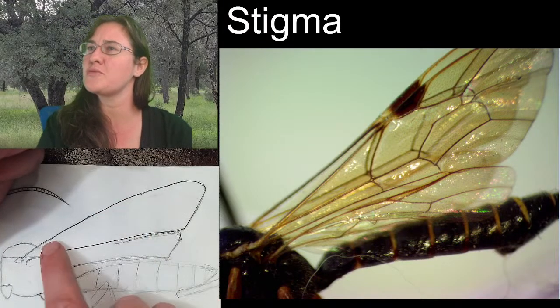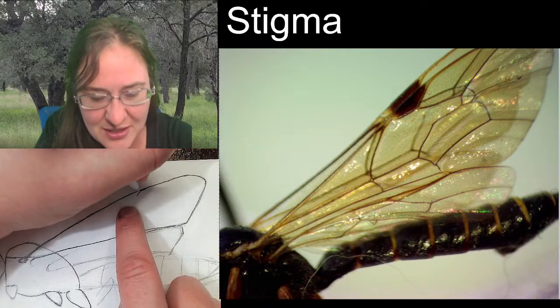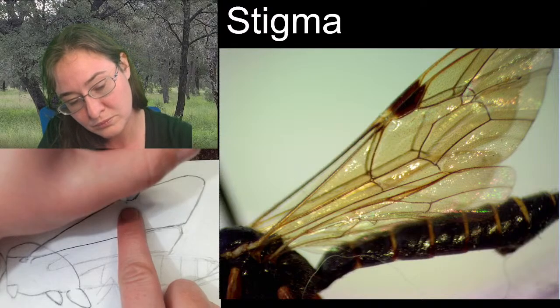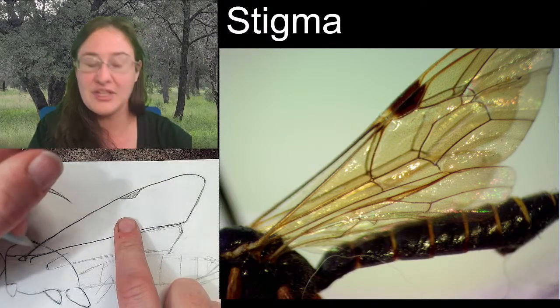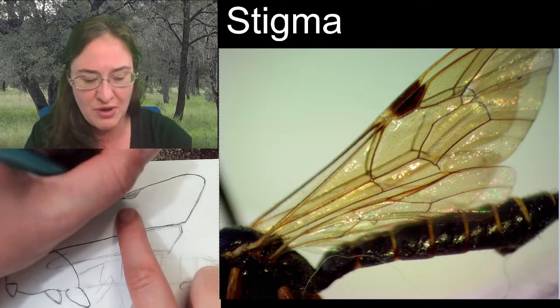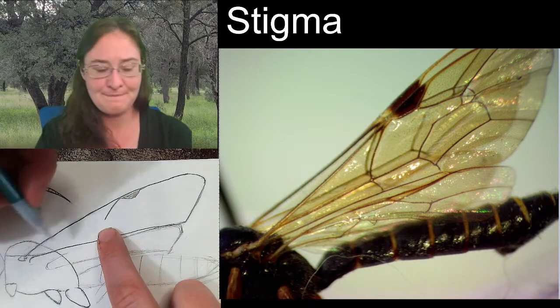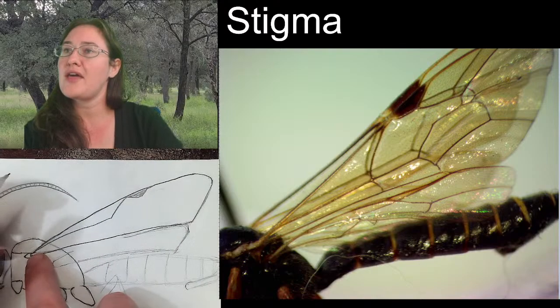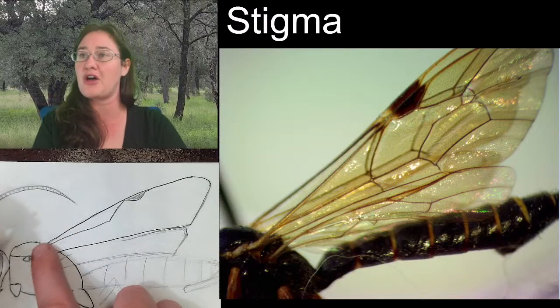So I'm going to start by finding the spot for my stigma, and I'm going to say that it is right about here. That's the darker spot in our wing. Now, the leading edge is the costal vein, so we don't have to worry about that. Coming off from the front of our stigma, we do have a vein that comes down like this. Then, coming from here to the center, our costal vein splits right here, and I believe because it splits off of the costal vein, we would call this the subcosta.